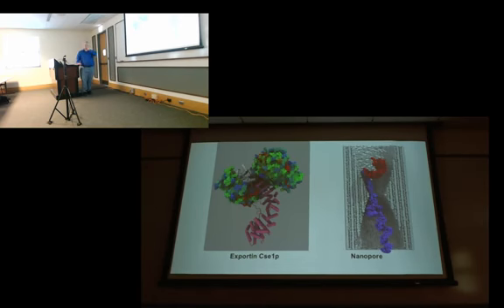So I will say that there are ways of getting crude approximations to this in OpenGL, but it comes at a very high performance cost, and there are quality trade-offs, particularly when you get into rendering movies. There are ways of faking ambient occlusion lighting or approximating it in OpenGL, and they use these for video games. And in a video game, you don't really care.